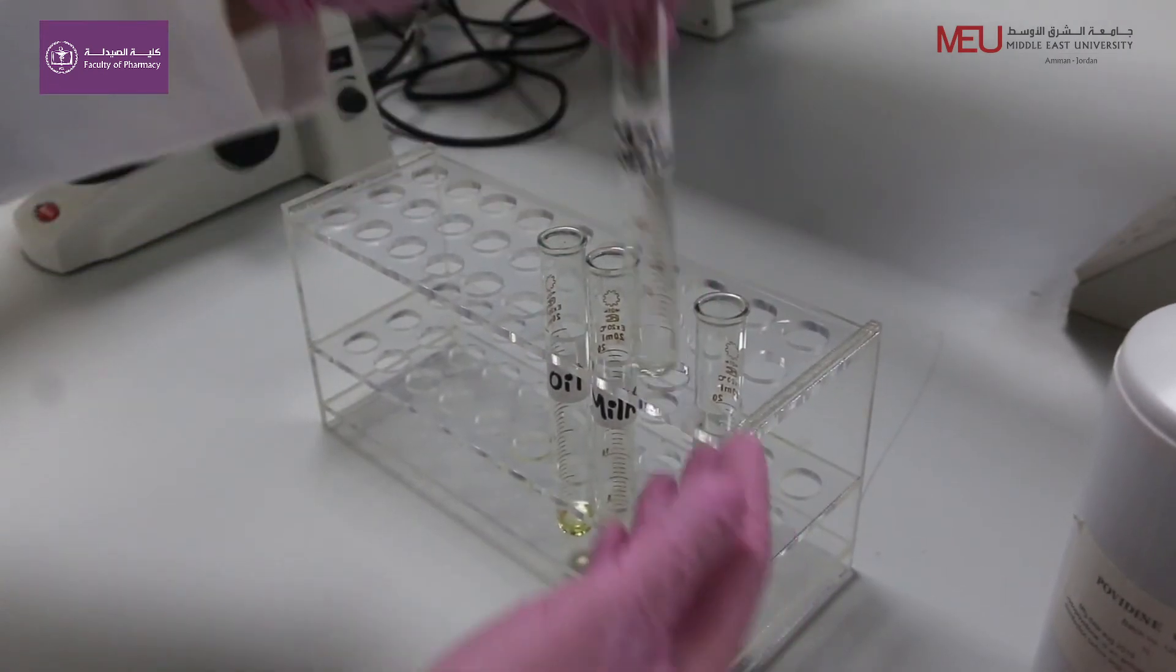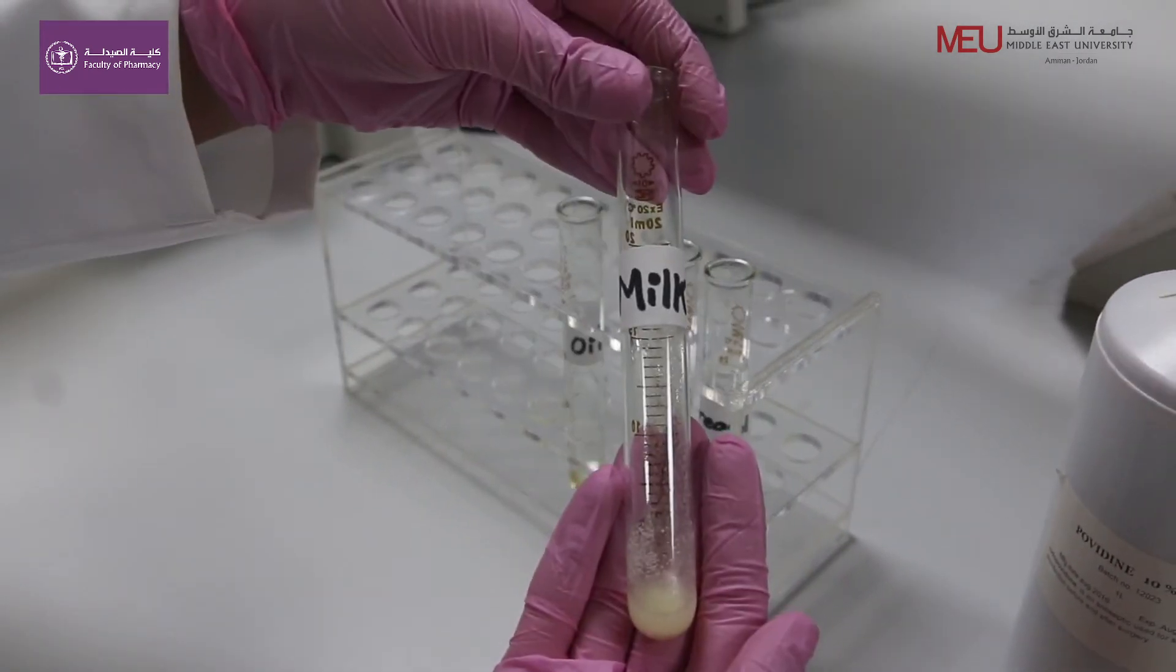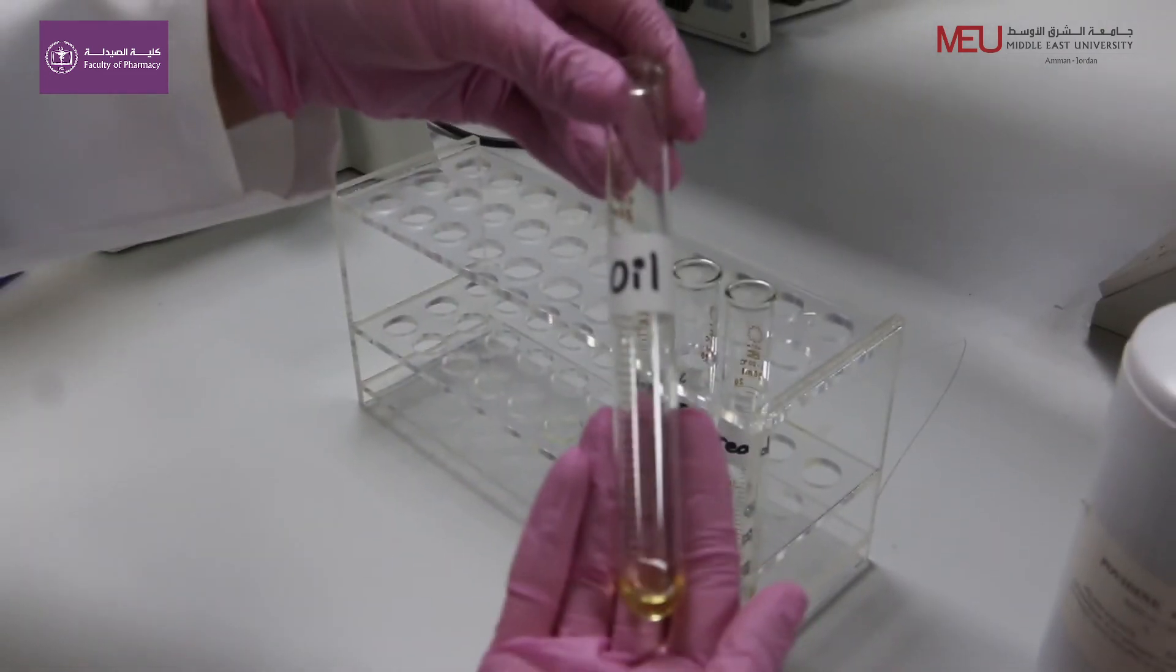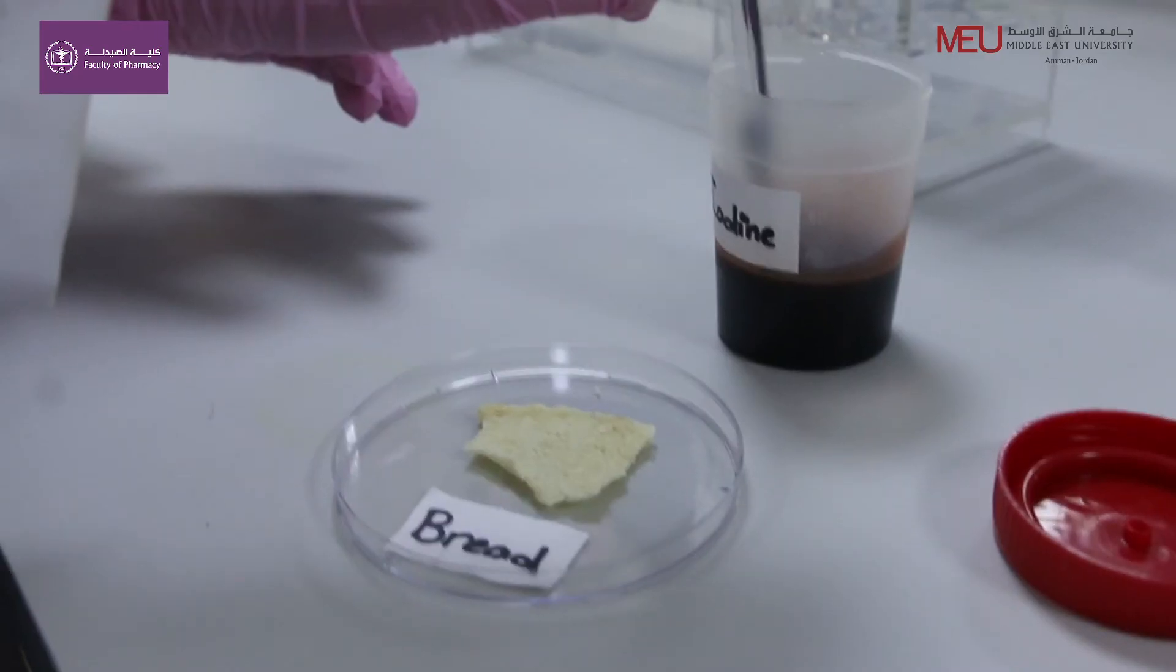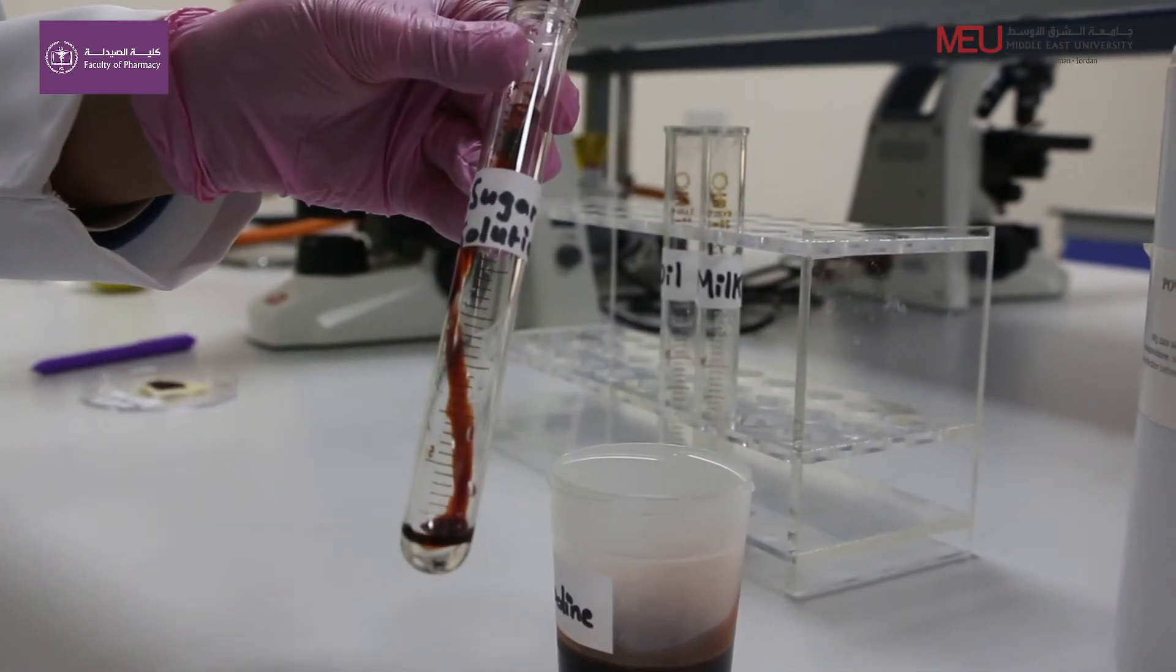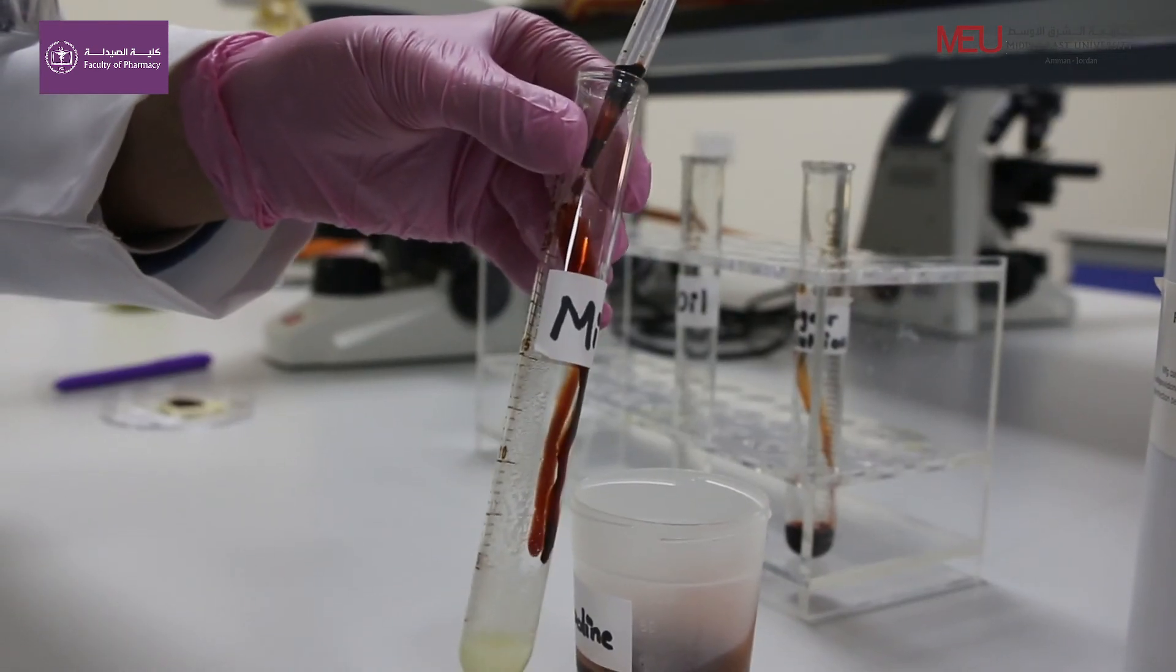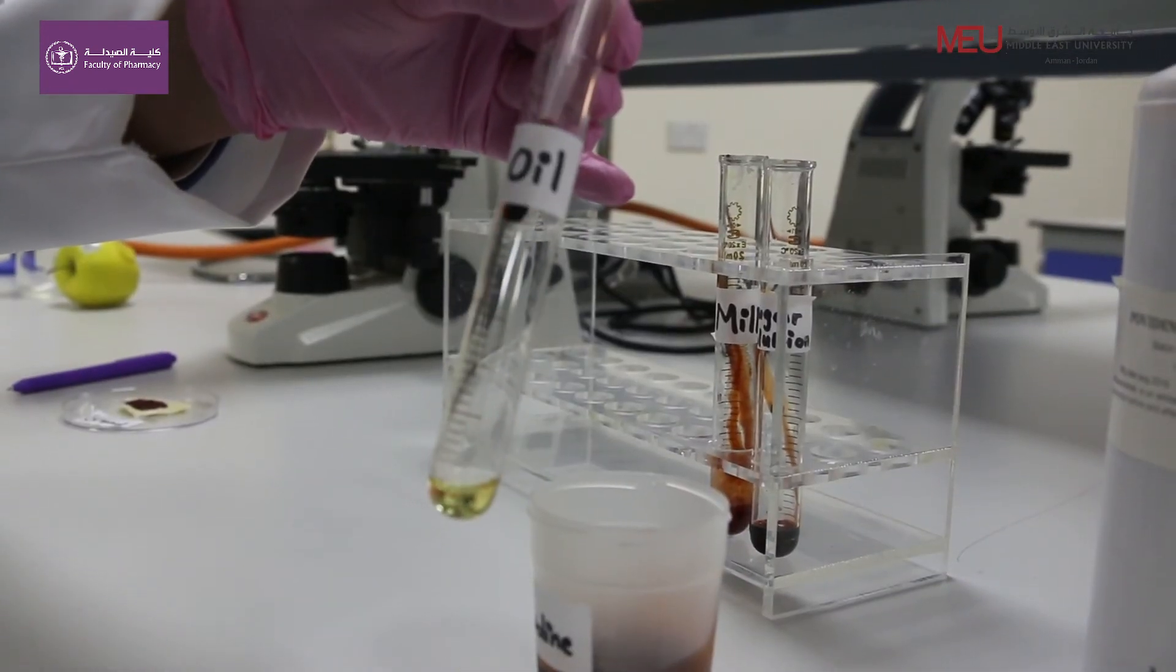In each test tube place 1 ml white sugar solution, 1 ml milk, 1 ml oil, and place bread pieces on a petri dish. Place one or two drops of iodine solution on each food item and observe the color change.